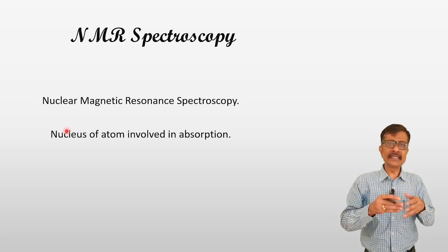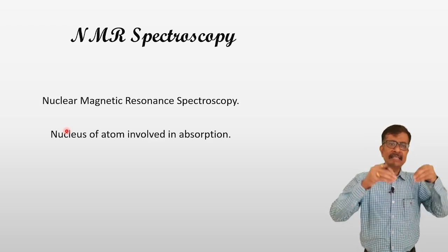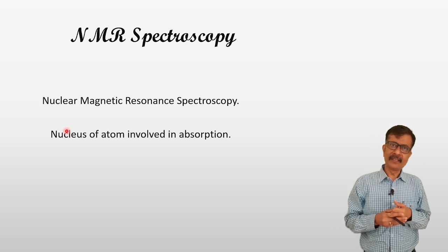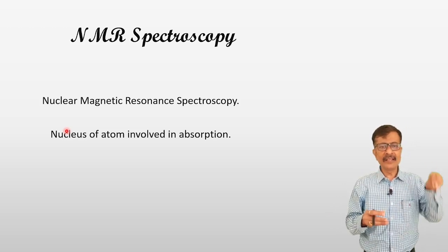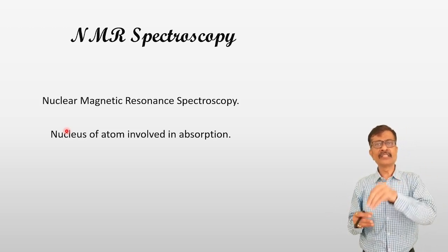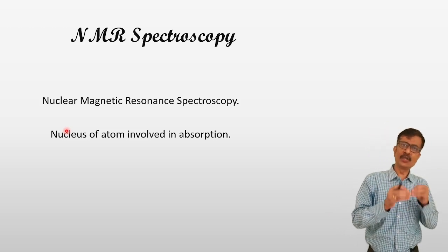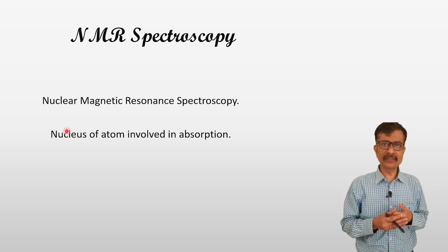This is known as the nucleus being in resonance with the radio waves provided. So the name nuclear magnetic resonance spectroscopy. Here the energy source used is radio waves.